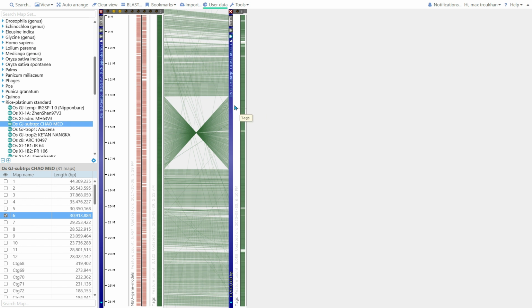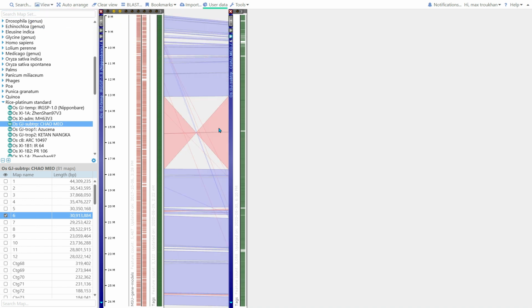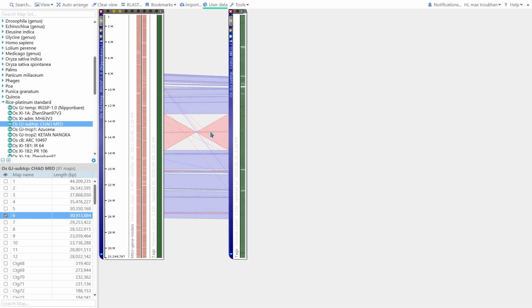At the scale of entire chromosomes, the sequence similarity can be found by engaging Minimap 2. This is done with a click of this button. When the maps are oriented vertically, the visible sequence on the right will be passed to Minimap 2 as a query and compared to the neighboring sequence on the left.